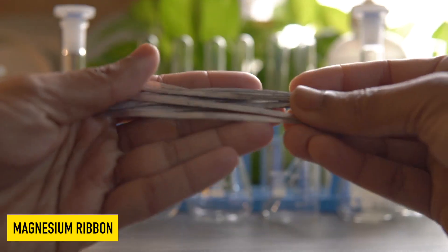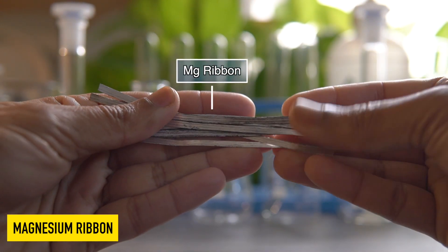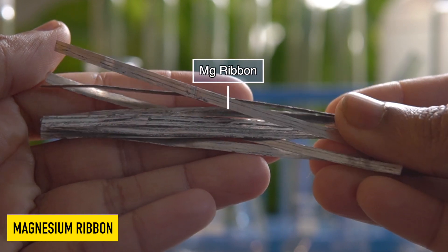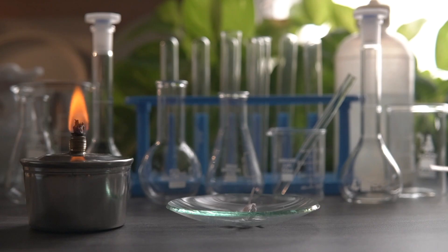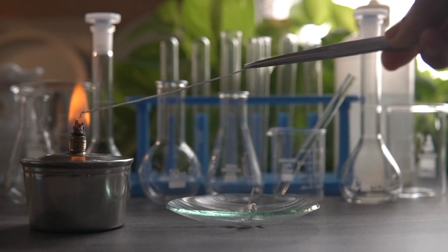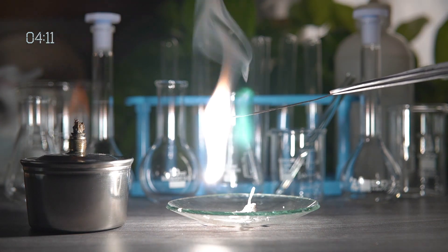First we will cut the magnesium ribbon in small pieces about 7 to 10 cm in length. Now wear the safety goggles for precautionary measure and using tongs hold the magnesium ribbon over the flame.